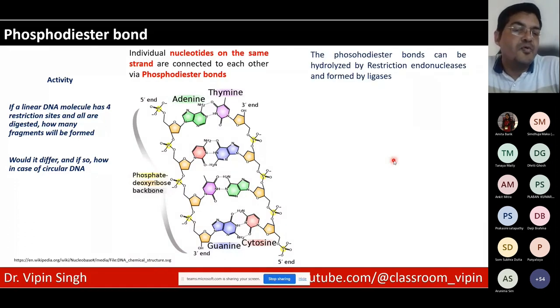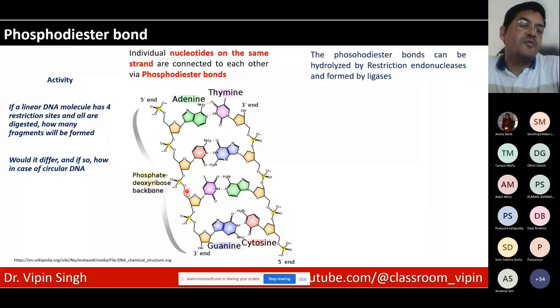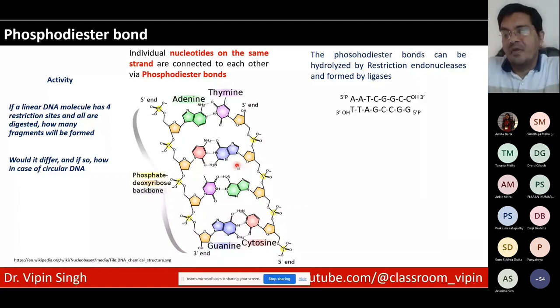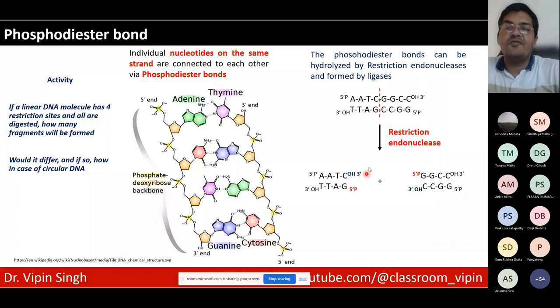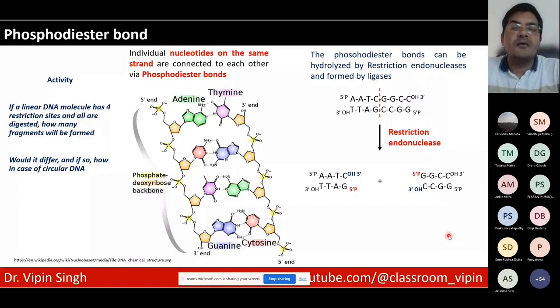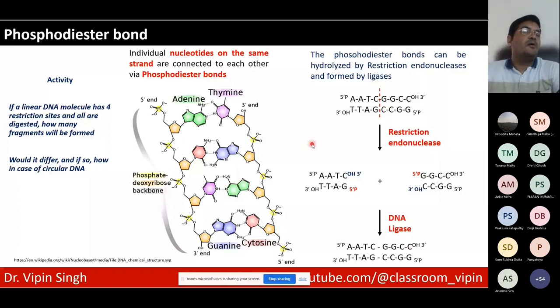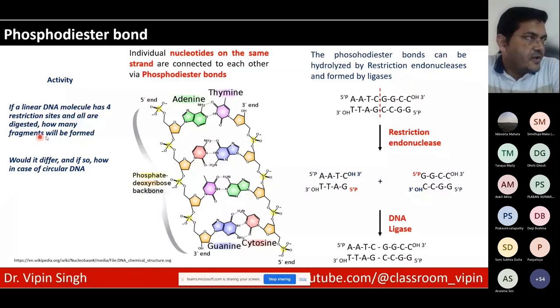The phosphodiester bond is what is broken when a restriction enzyme acts. Ligase can restore those bonds. A piece of DNA can be hydrolyzed at a specific site to produce two molecules, then a new DNA fragment can be inserted, or the ends can be resealed with ligase. This is the entire process of restriction digestion and ligation. If a linear DNA molecule has four restriction sites and all are digested, how many fragments will be formed?